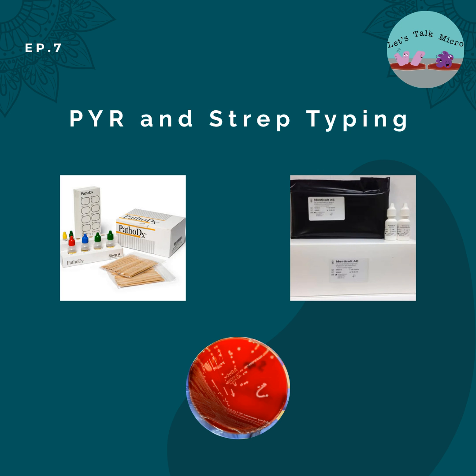adding something else. So with the PYR, I always recommend, especially with the students, when you're getting started, because sometimes you're gonna have those iffy reactions, like is it positive, is it not? So if you're using the disc or the card, I recommend that you apply your colonies in more than one area. That way, if you have a positive result, you're sure, like you see in the two pink areas. That's pretty good with those color reactions.